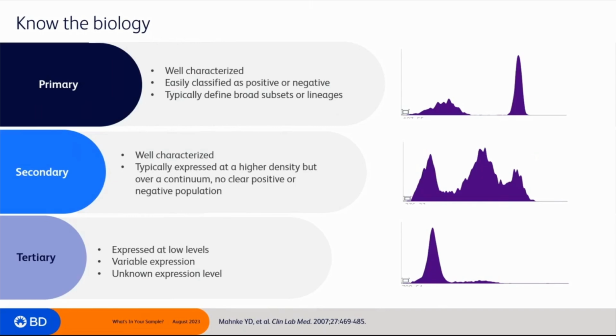Your pathologist might come in and say, I want you to bring on the B-ALL MRD panel, and in his or her wish list there may be CD58, and you never worked with CD58 before and you don't know how the cell would express it.